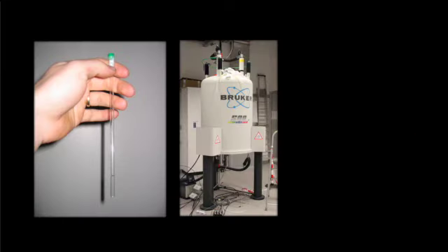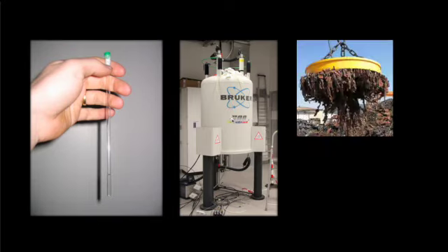So here's how the instrument works. We take an NMR tube and we fill it up with our organic compound. And we take that tube then and we place it inside of the chemistry instrument known as the NMR. So the NMR they come in all different sizes and shapes. Here's a fairly big one, but the tube goes down inside of this cylinder, down inside of it. Now there are 2 things that NMR is going to do for us. One thing is it has a great big magnet inside of it.